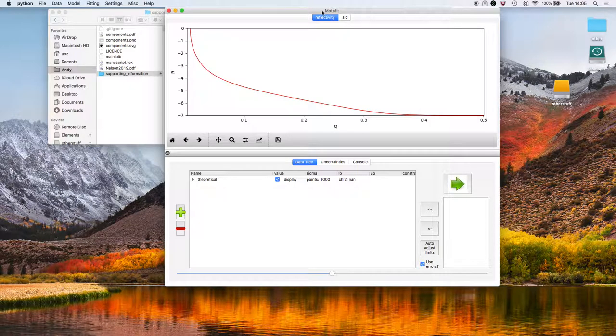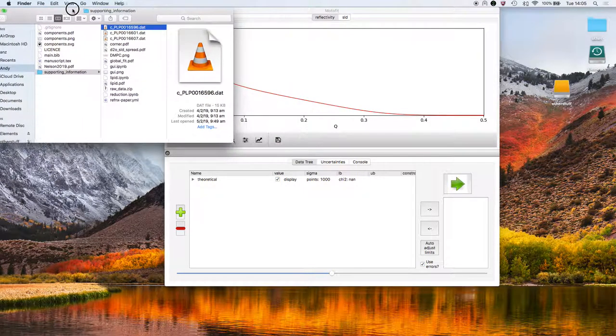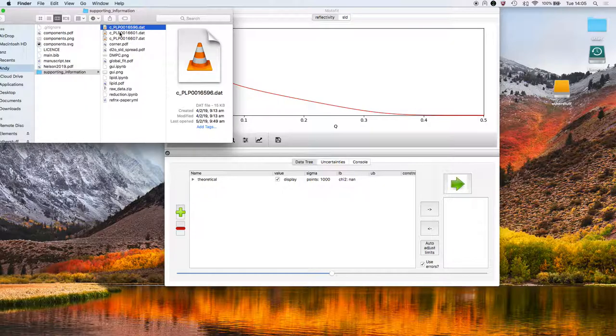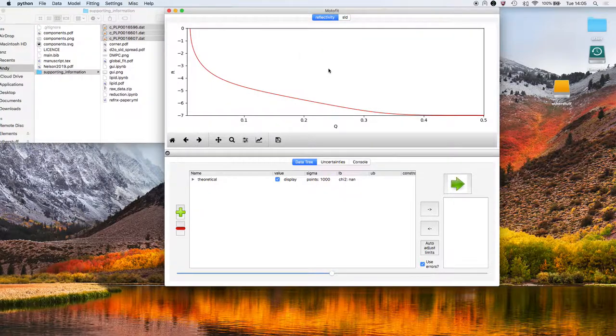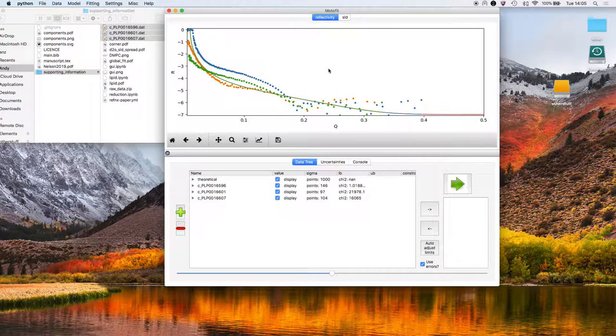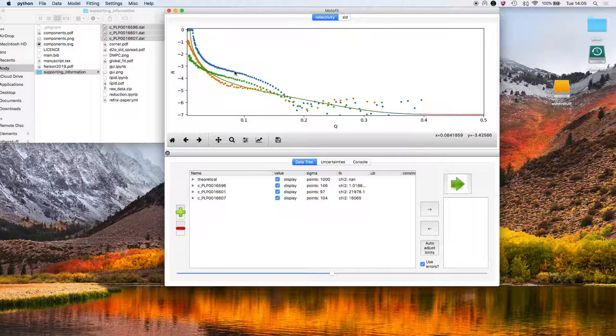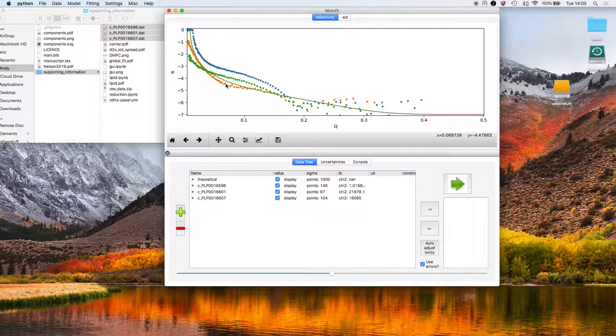What we're going to do in this tutorial is fit three lipid bilayer datasets. They're DMPC. We'll select the datasets we want to load, drag them into the app. These are the three different contrasts that were measured in D2O, in 2.07 and in pure water.